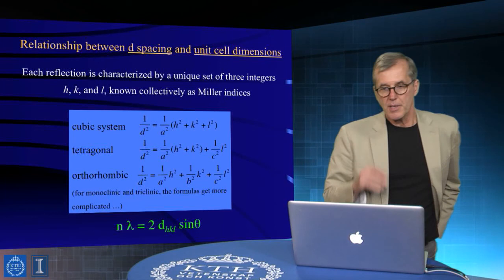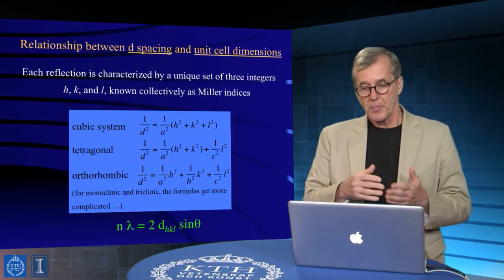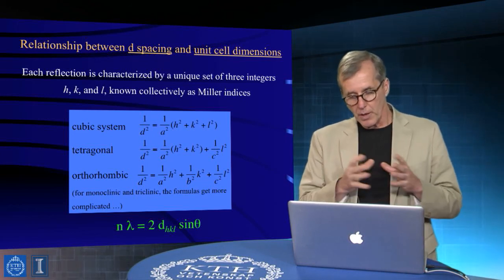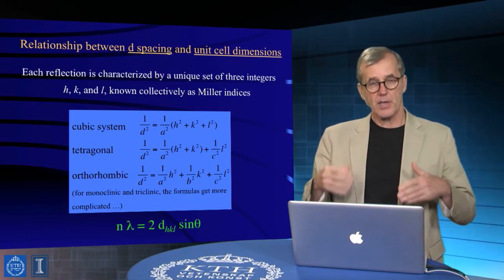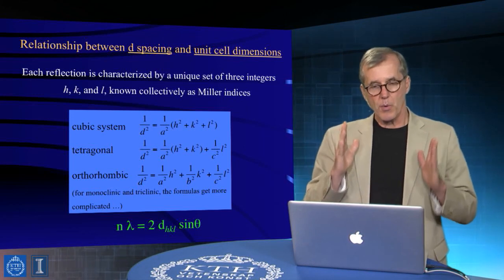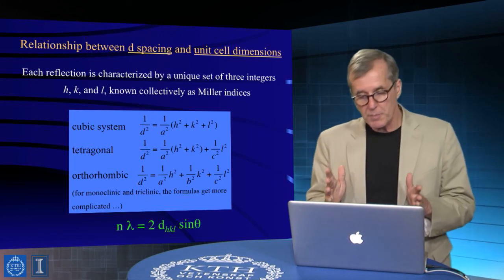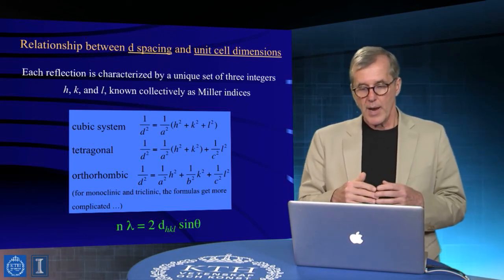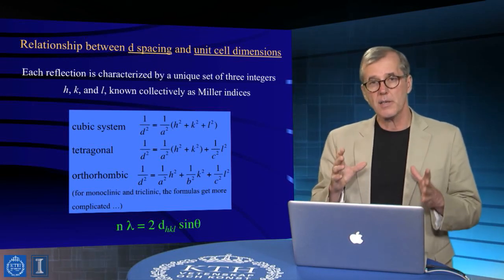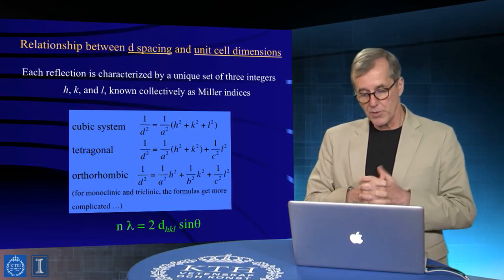Okay, and the d-spacings can be related to the nature of the unit cell in very characteristic ways. So if you go into the details of X-ray diffraction, things that would become the point of focus in a more extended treatment of this subject would be how in fact we analyze the known existing forms by which crystalline solids form.